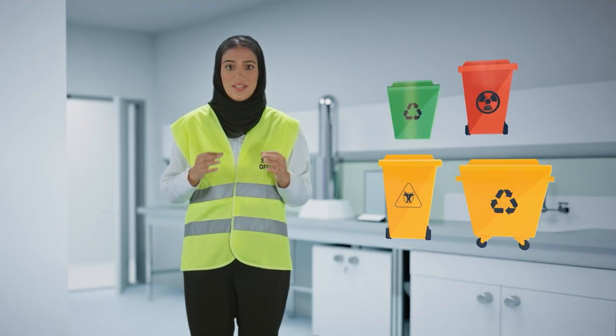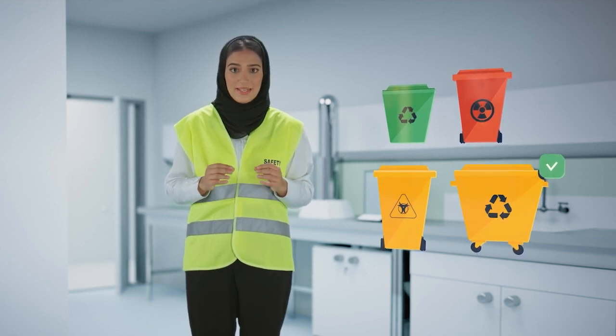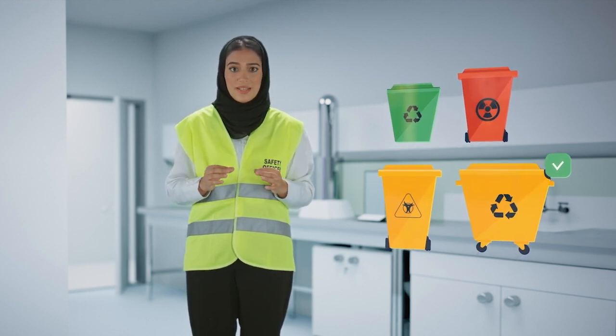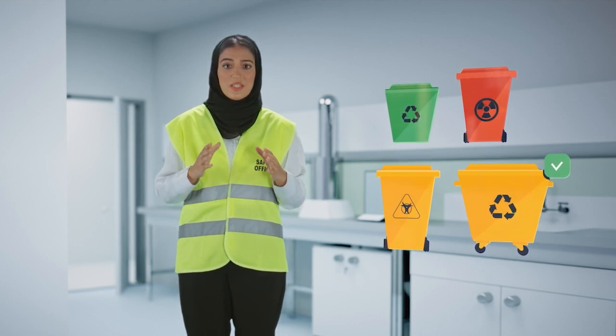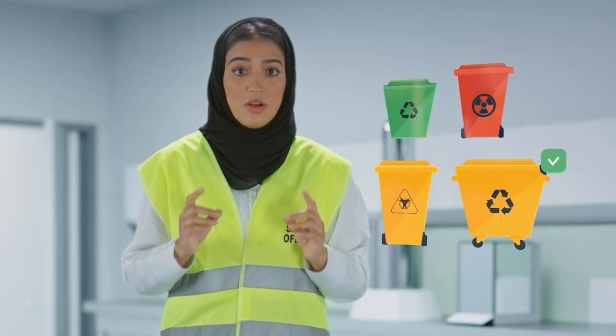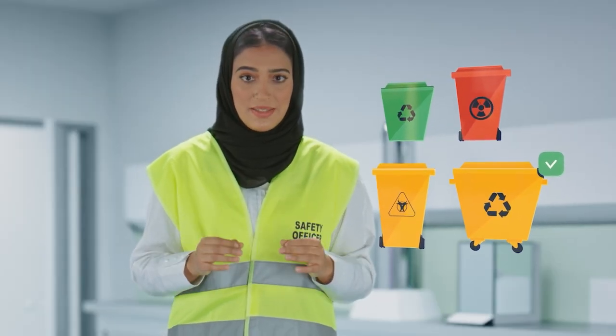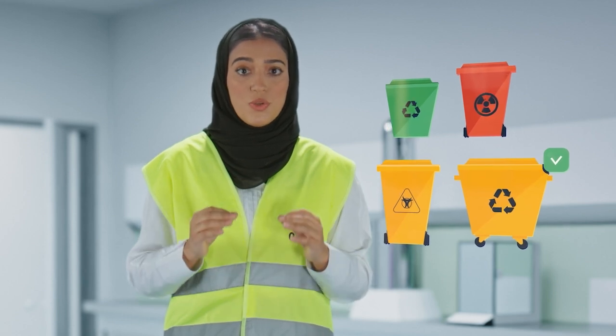Your instructor will direct you to use designated labeled waste containers. Most likely, different containers will be utilized for different classes of chemicals. Handle your waste materials in the specific ways designated by your instructor. Pouring waste into the wrong container could result in unexpected adverse reactions, leading to fires or explosions. Ensure to pay attention and follow instructions.